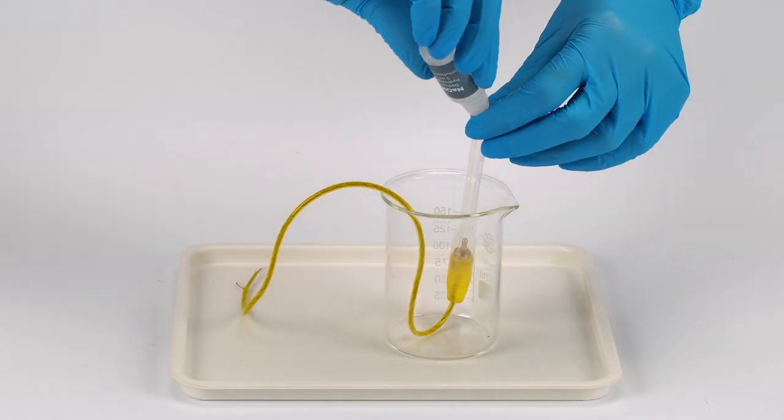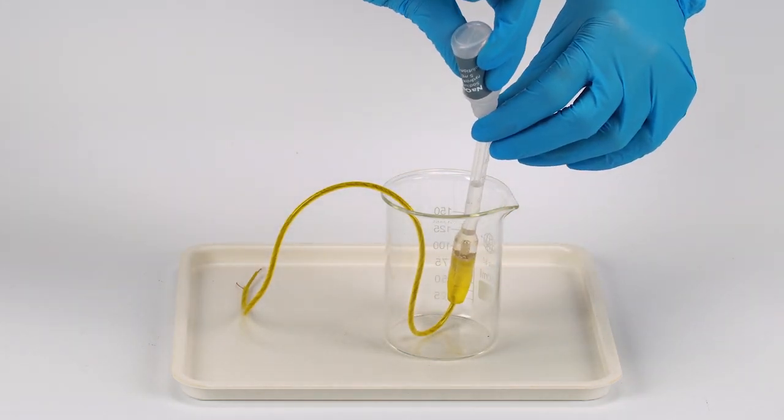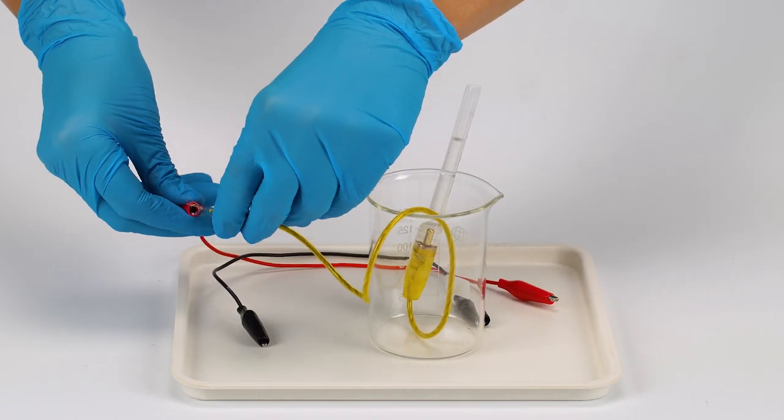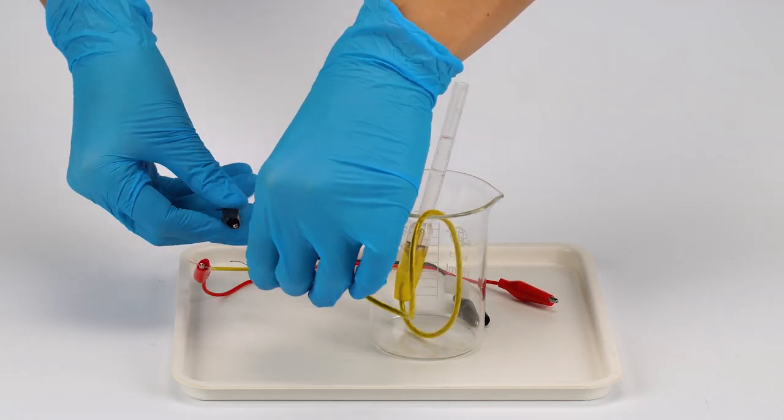Fill the pipette halfway with sodium hydroxide NaOH solution. Hook up the crocodile clips, the red clip to the longer wire, and the black clip to the shorter wire.